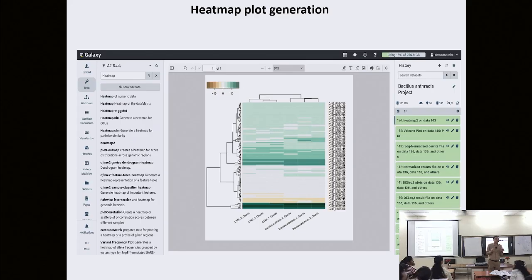Which would indicate that those modules are differentially expressing under this stress condition. Okay. So sometimes you would want to go above genes, because when you do RNA-seq experiments, you can have thousands of genes differentially expressing. For example, if you are doing some plant species, there could be 10,000 genes that are differentially expressing, and it's a challenge to interpret this.